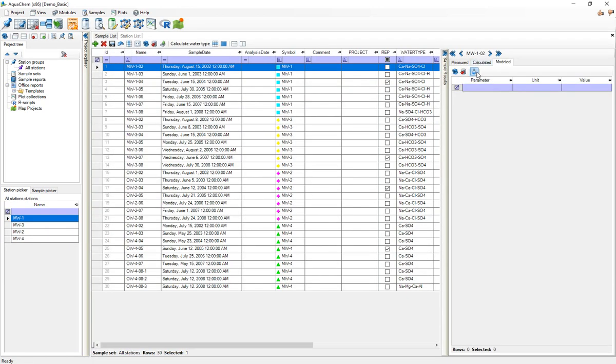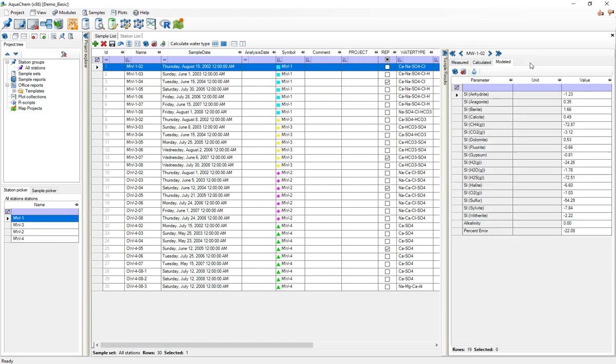Now if I click on a sample and I press this calculate saturation indices and activities button, AquaChem will do just that. It'll use PHREEQC to calculate saturation indices, alkalinity, percent error, all these different parameters that I imported. It's now able to save these results and associate them with the sample. So now PHREEQC is essentially set up for this project.